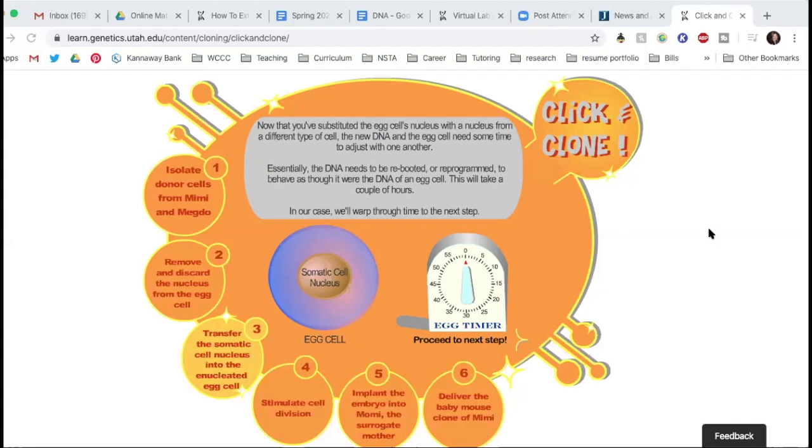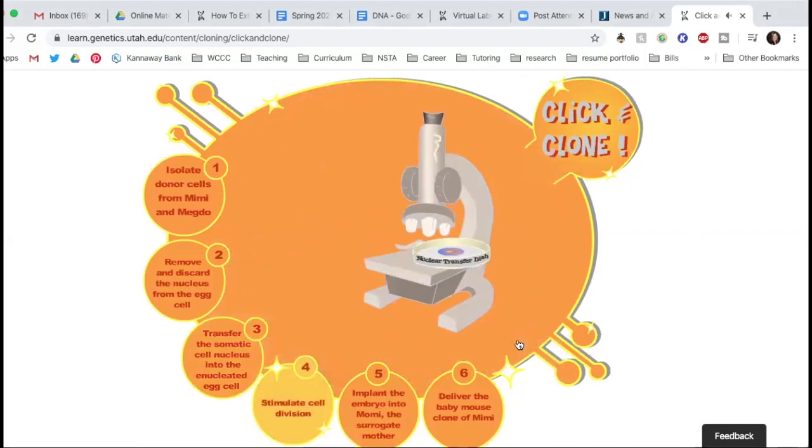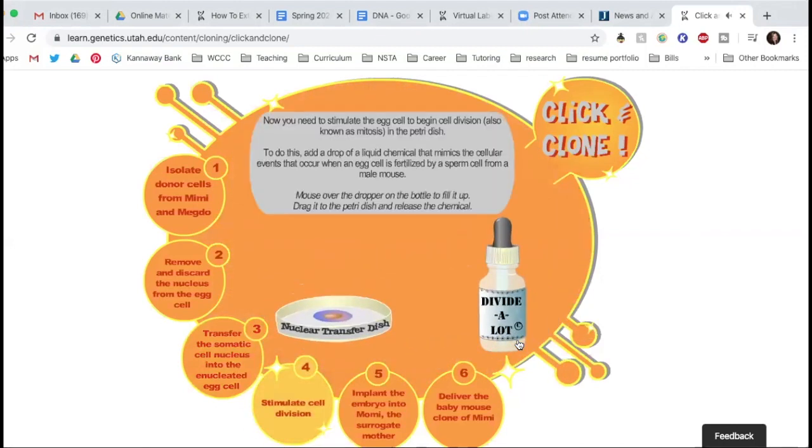DNA is still being understood and studied, but DNA put in different environments will act differently. We're putting it into this egg environment and it's acting like egg DNA. Now we're going to stimulate cell division. You need to stimulate mitosis to occur in the Petri dish. To do this, you're going to add a drop of a liquid that mimics the cellular events that occur when an egg cell is fertilized by a sperm cell from a male mouse.